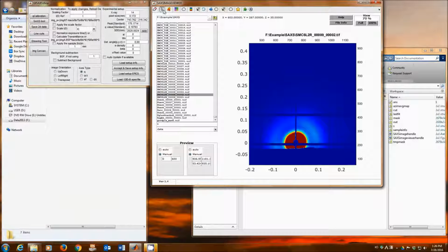If you click this button, and then go over to the data, not only those values, the pixel coordinates and intensity, but you can also read the new coordinates. The two sets of new coordinates are displayed here for the 2D powder samples, maybe also 3D powder samples.